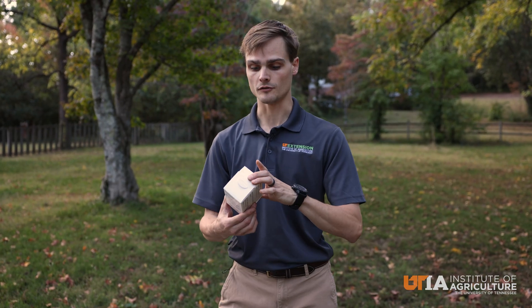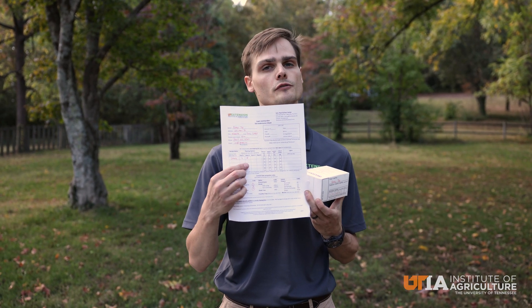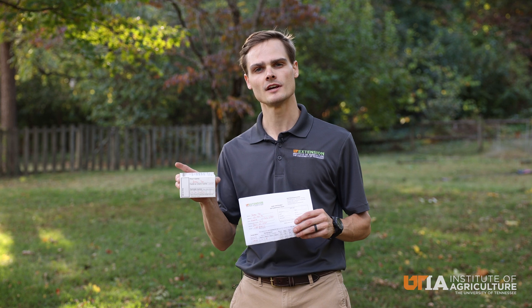We want to make sure of two things: that our name is on this soil box and that we have the same sample name. I've just made one up called 'lawn' — make sure that this matches our submission sheet, which I also have labeled 'lawn.' I've included crop code L for lawn so I'll get soil recommendations for my particular lawn, and I've also added crop code G for garden in case I want to locate a garden on this property as well. Now our sample is ready to go with the submission sheet and the box, and we're going to send this off to the soil plant and pest center.